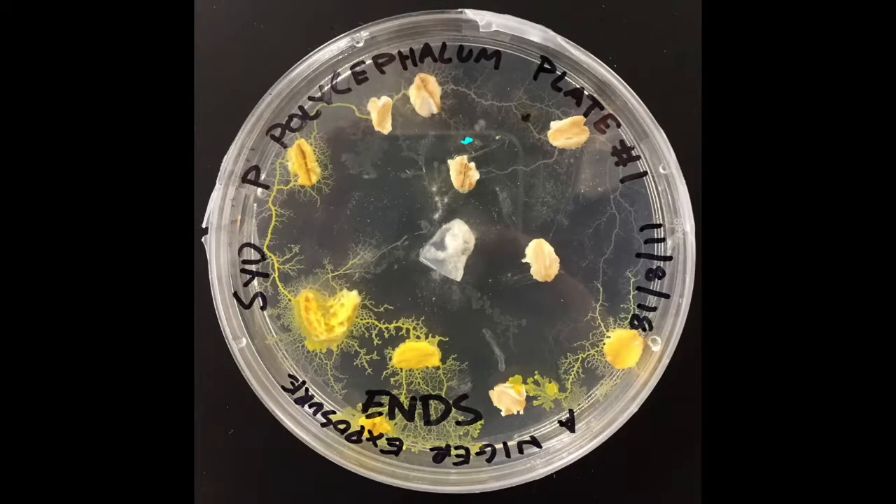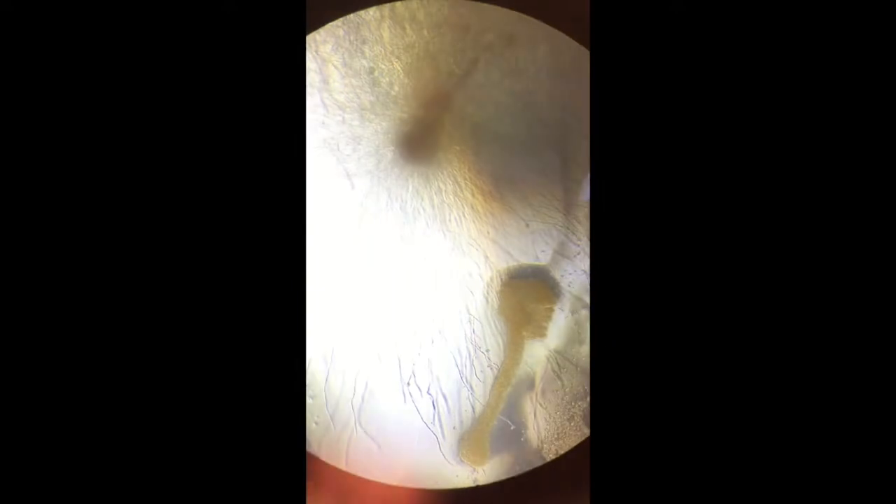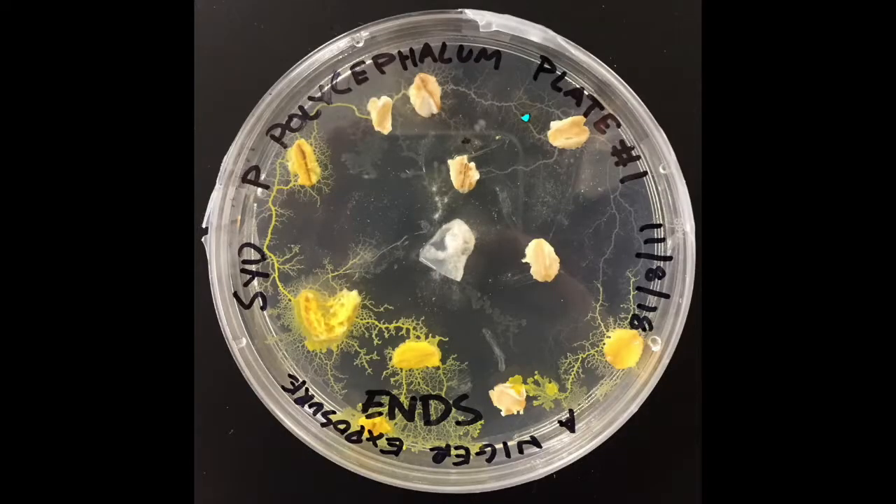Hour 47 is the next checkpoint. Looking at the left one first, you can see a dramatic change in where the slime mold is generally — it's now occupying the entire lower half of the dish instead of the upper half, and only one little blob of living slime mold is visible, and it seems really confused and alone. That's because all of it has migrated again down to the bottom of the dish, and we can see the hairs of the Aniger really spreading. Looking at the right, we can see the same thing — completely devoid of living slime mold, just slime trails and Aniger fibers in this region.